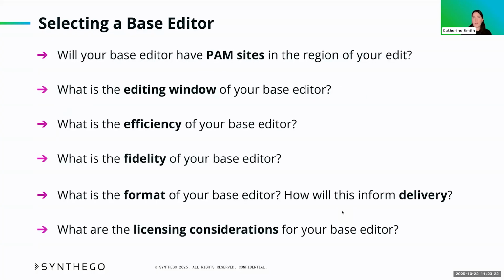Once you have some editor candidates in mind, you'll want to consider the specific attributes of these editors. For example, does your base editor have PAM sites where you need them? What's the editing window of your base editor? Is your base editor efficient? Is it specific?